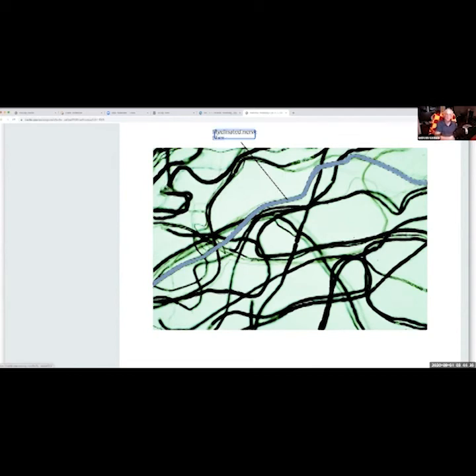Okay, there are areas in the nerve where the sheath is split, it doesn't combine. If you look here, I know it covered over it just right there. What else? There we go. This is myelin. This is made by the neuroglial cells. Myelin is the nerve sheath that surrounds the nerve, allows it to transmit extremely fast.